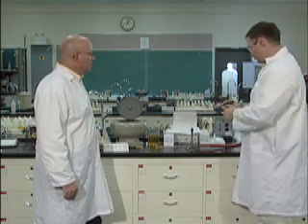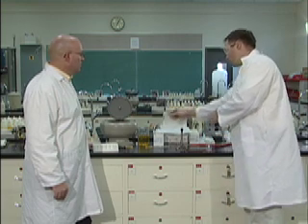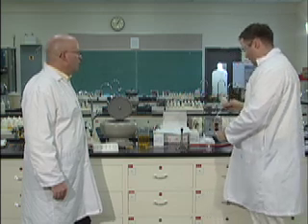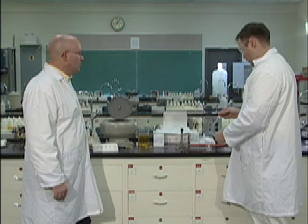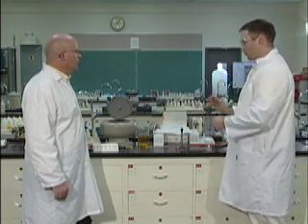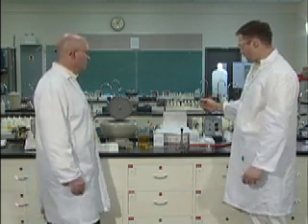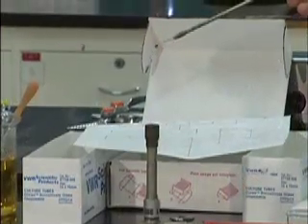I get you. So with this, the easiest way to do it is take a beaker to the fume hood. Make sure when you're using the Bunsen burner that you take off your gloves. And you're going right back to the original solution, not to one of your decants. This is the original solution. You're just going to put a couple drops on the end of a loop. You got it hot first. Yeah, I cleaned it off and got it very, very hot until there's no more flame. And now I'm just putting it on the top of the little blue flame in the middle.